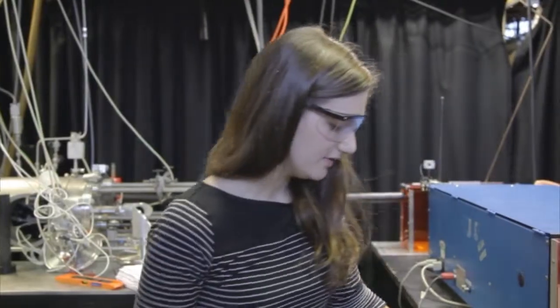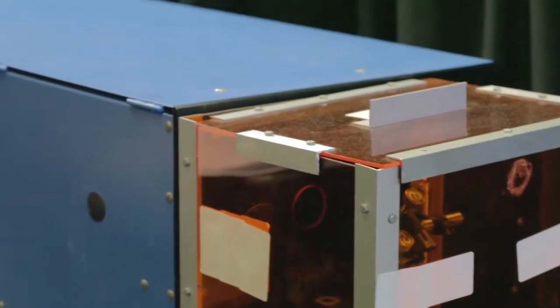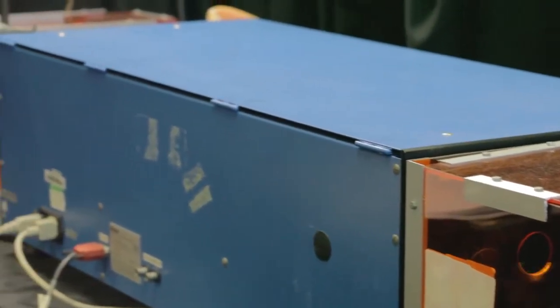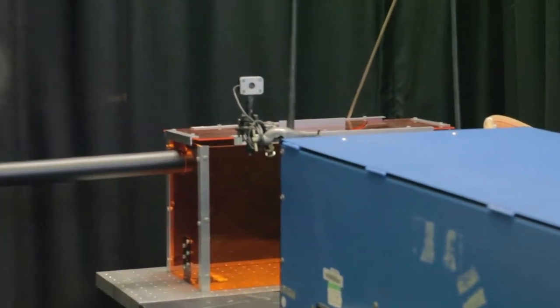So we need lasers in this case to measure the temporal evolution of the OH radical, to look at how it decays away, and therefore to look at the rate coefficient for the reaction which I'm looking at. So I've got two lasers here. This is a YAG, which pumps our dye laser, and this is our probe laser, which excites the hydroxyl radical to a higher state, then it emits fluorescence, which we collect using a PMT.